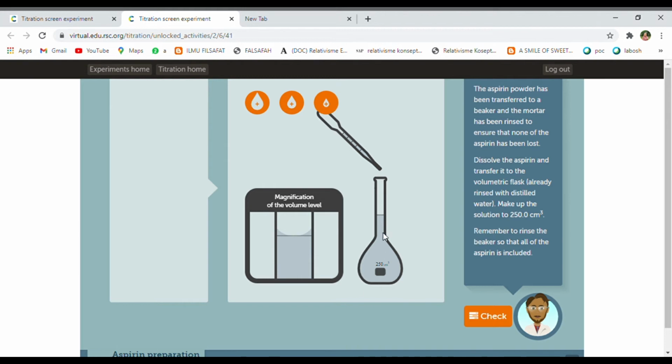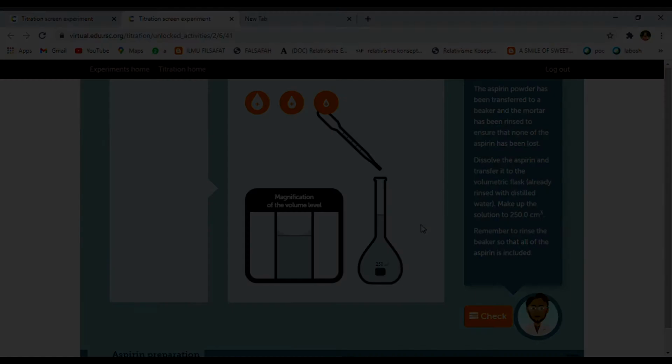Now, we have obtained a homogeneous solution.